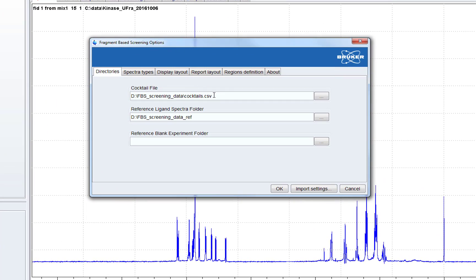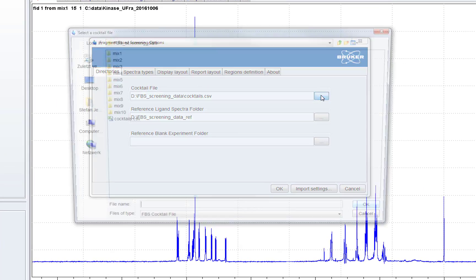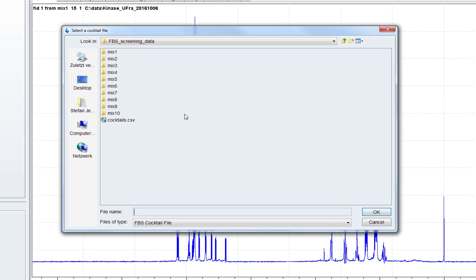Then a dialog will open, if we open the screening project for the first time, where we have to choose the COCTAS definition file.